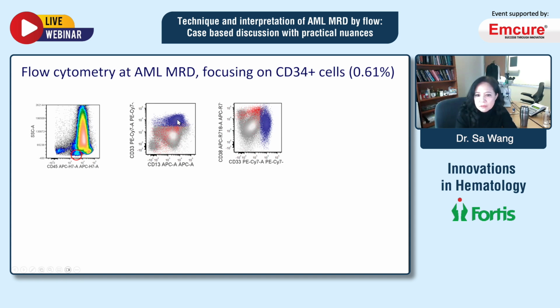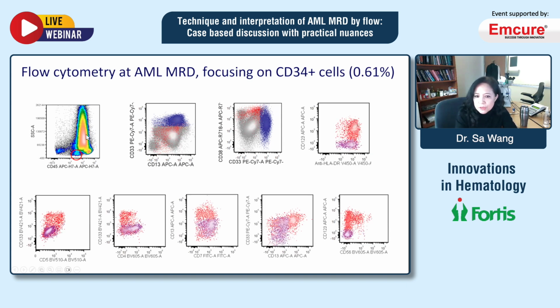If you see, there are a few monocytes, mostly actually granulocytes, right? So these gray cells are granulocytes. If you look at the CD34 positive cells, we do have a huge population, the purple cells, committed to the erythroid. So they don't have CD123. We have myeloblasts, then we have erythroid precursors. The erythroid precursors do have CD4, but like their myeloid precursor, they also have CD7. So they don't have CD13 and they don't have CD123, right? The myeloid precursor actually has CD56.